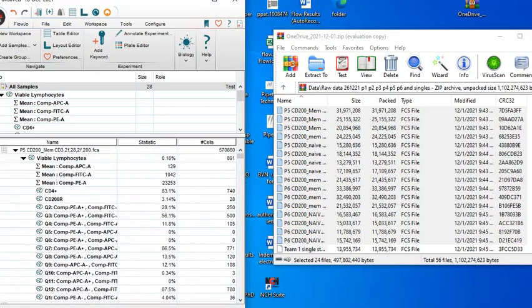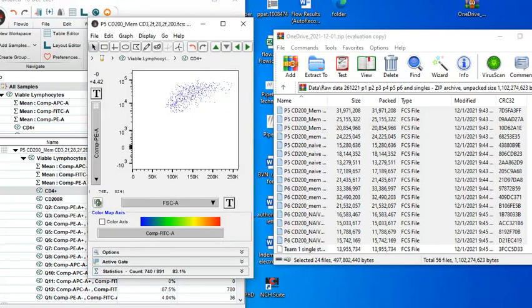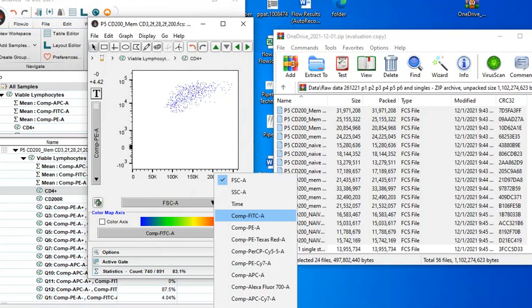We'll call it a day today. Next time, I'll show you how to run a contour. Everything here you see is actually your CD4 cells. And so, since we know that everything here is your CD4 cells, we can actually do a contour map to see what it looks like.